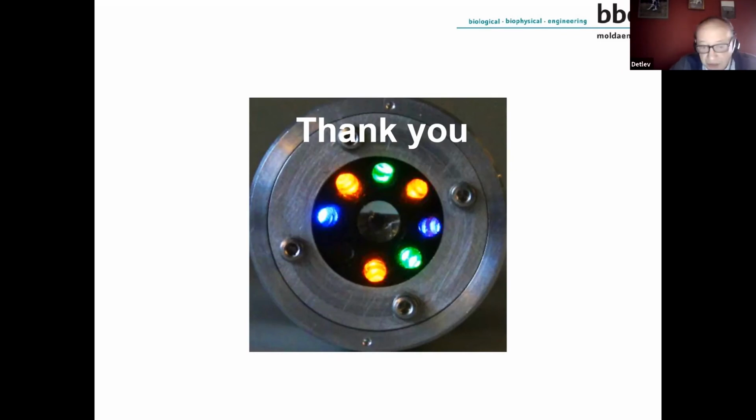And at the end, as I showed you for the calibration procedure, we found that four algae species are sufficient to perform this calibration. Not at all times, but most times. So these four algae are representatives for all the classes that we usually find. If you see that there are differences, we can adapt it.